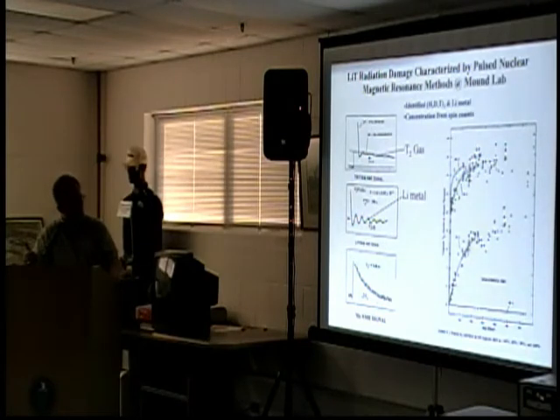And then this long decaying line, all the helium is a long decaying line, about half a millisecond time constant, and no real sharp time. This is actually just the signal from changing the bandwidth to narrower, so we get less noise. And so this would be the helium-3 signal from a sample.